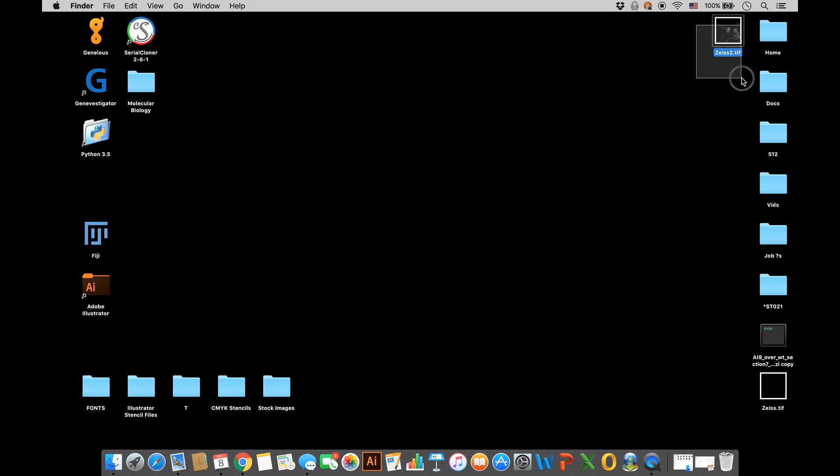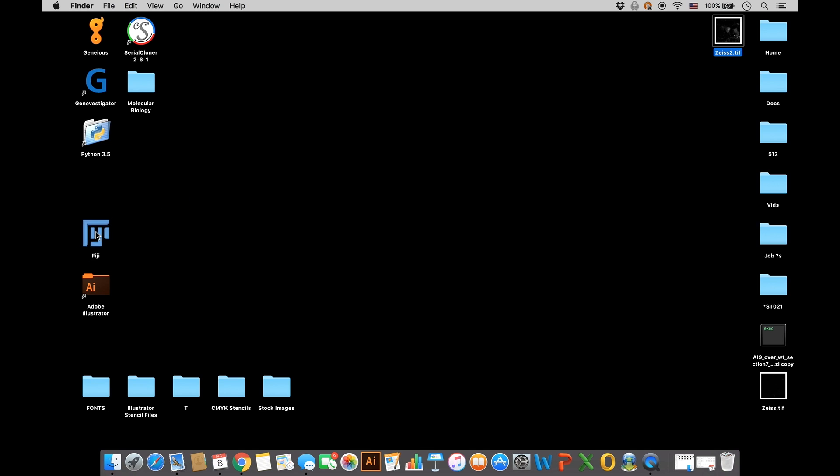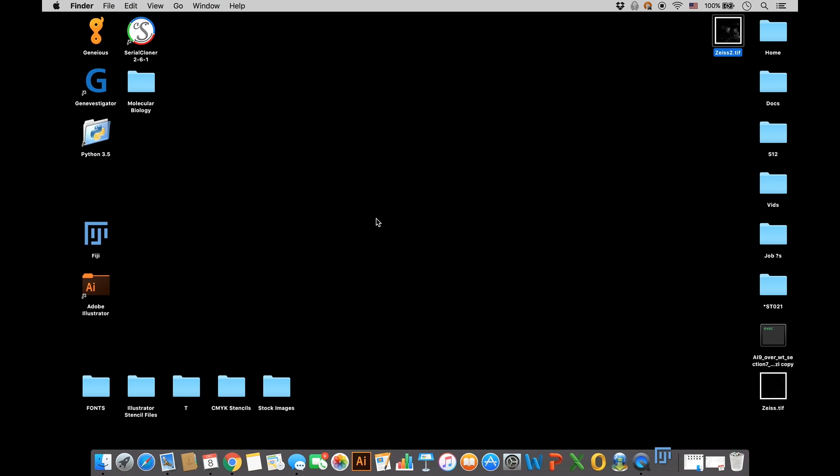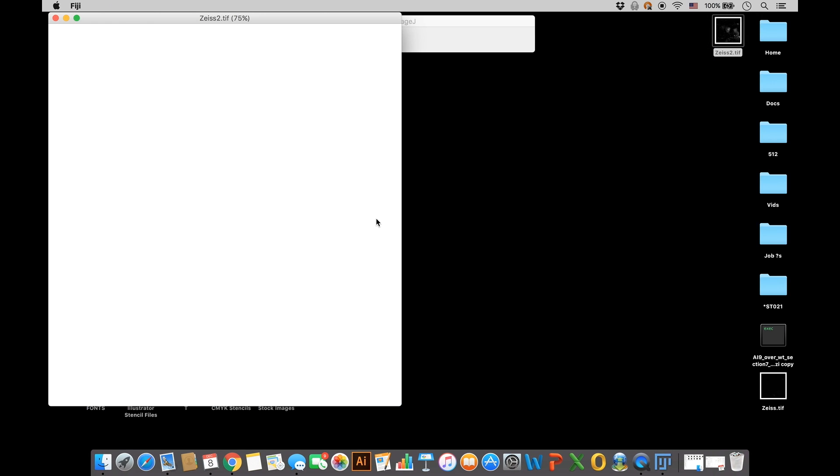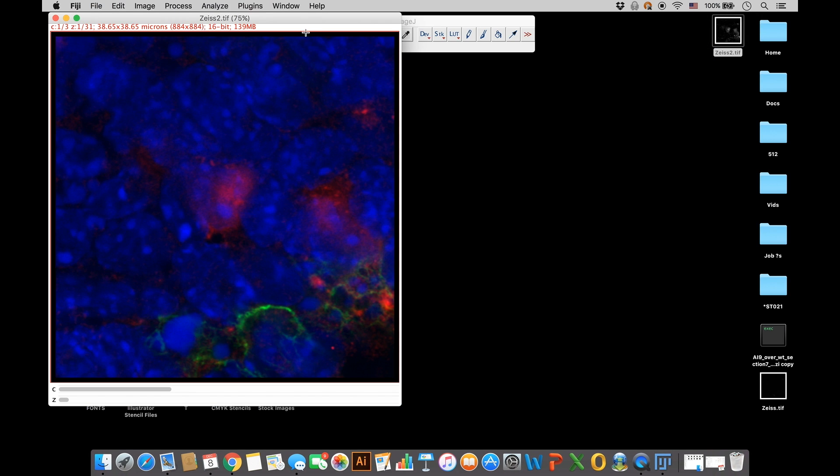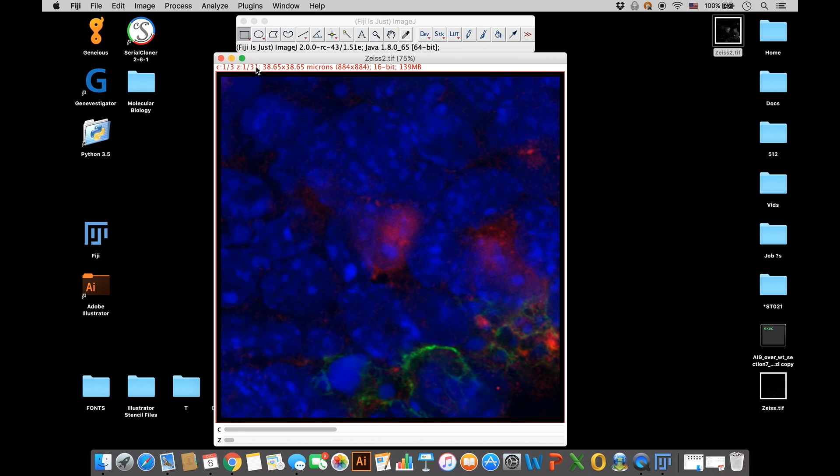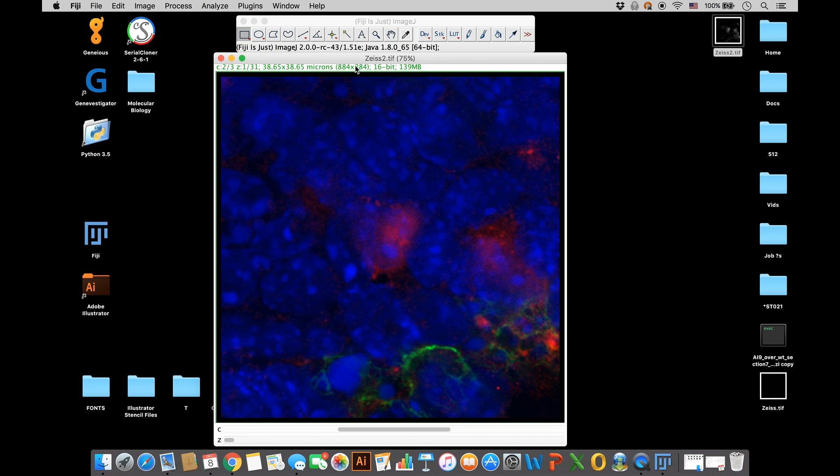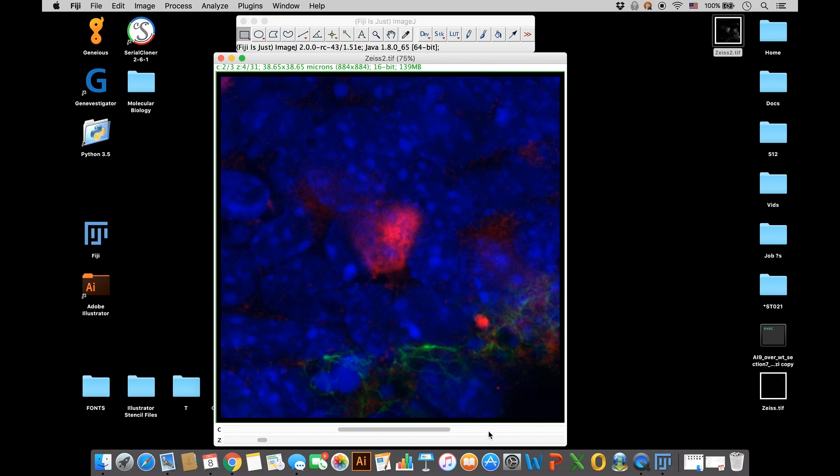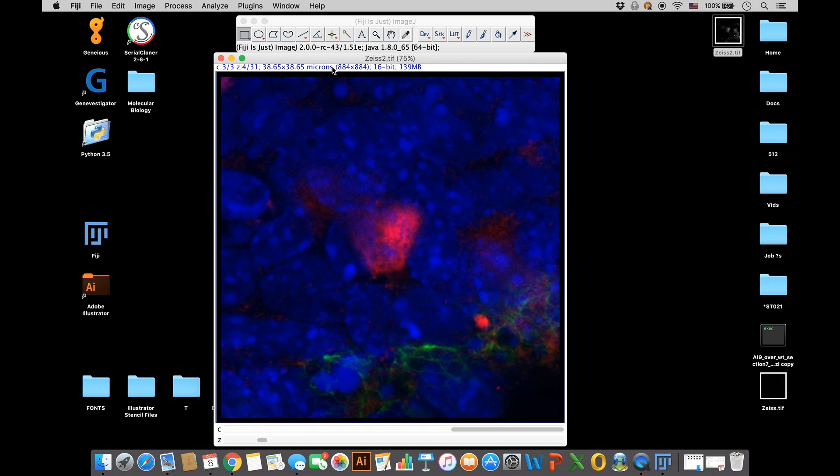I'm going to open my image file up in Fiji. Once it opens, you'll notice I have a microscope image here that has three channels, and those channels are red, green, and blue. You can see the text here up at the top that refers to the channel color you're focused on. You can leave the images merged and just focus on one color.